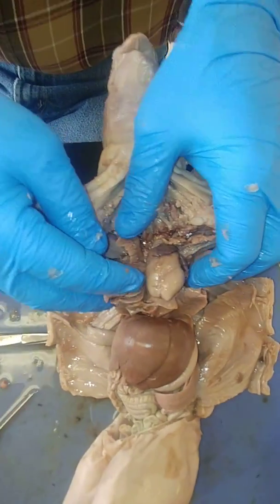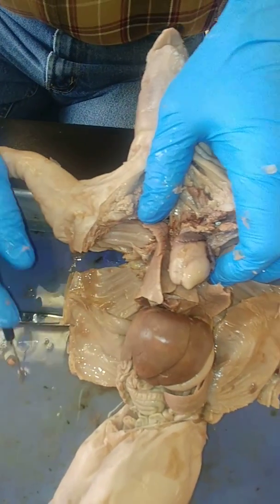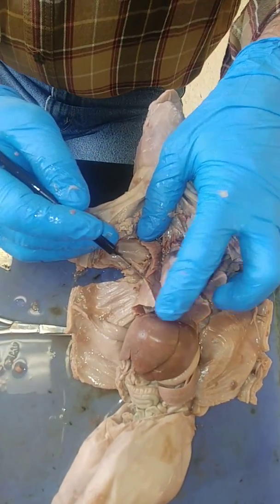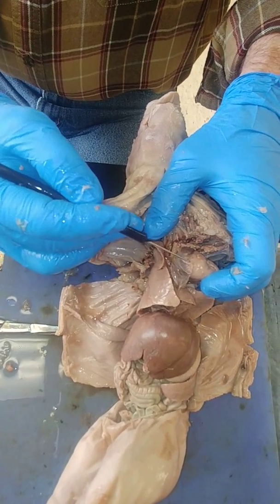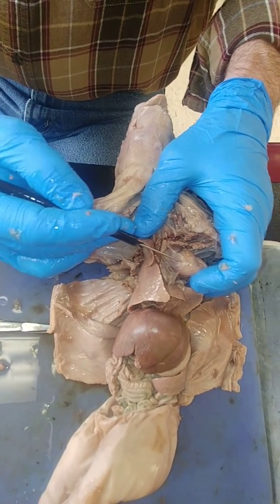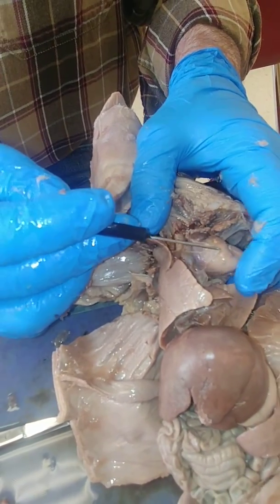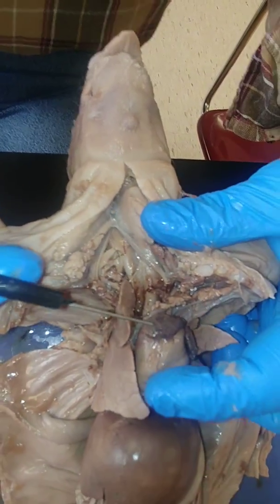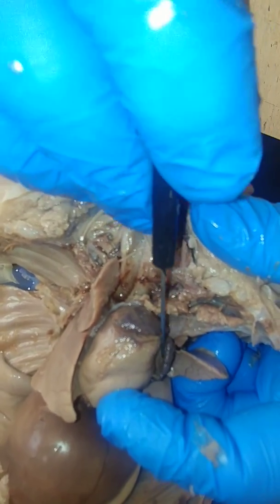Okay, with the heart, when we're looking at it, this bottom part here is cardiac muscle. When they do heart transplants, this is the main thing that they want really healthy when they're doing that. Also, I got it kind of cut when we opened it up, but when you hear about the pericardium or the sac around the heart or fluid around the heart, this little sac would be going all the way around and encasing it. And if there would be any bleeding in here, then it would tend to fill up this little sac and cause undue pressure on the heart. Up on top, this is the right atrium, and this is the left atrium.